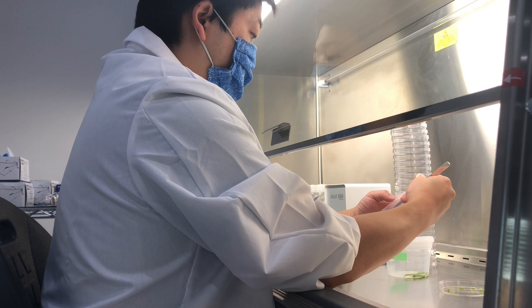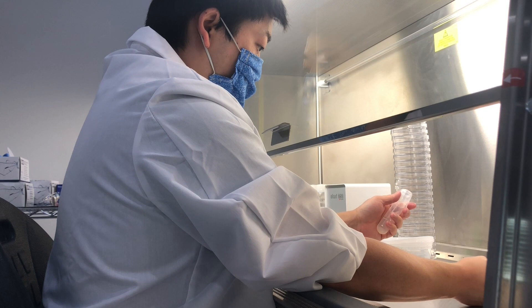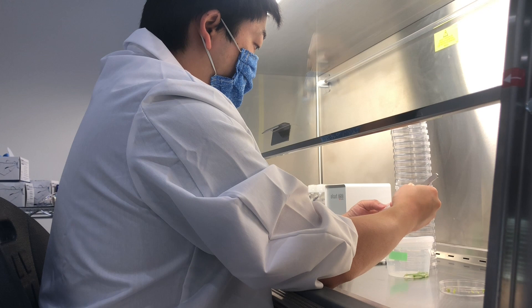Usually Brian, who runs the lab, makes a bunch of growth medium and sterilizes it and has it ready in test tubes — sometimes I make it as well. Right now the recipe we're using is based on the famous Murashige and Skoog medium. It's similar to a Japanese dessert in that it's mostly agar gel and sugar, but we also add some chemicals and hormones that are not edible, and those are designed to encourage the plants to put out shoots and leaves.